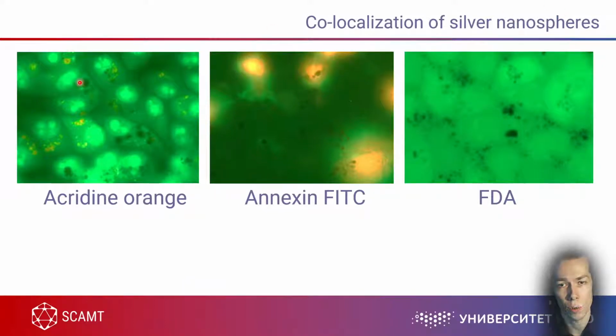Are they inside or outside? You don't even need to answer this question, because just look at the shape. The shape is very round. It means they are inside, inside some endosomes. And just look at this. It's the same nanoparticles, same culture, just different stainings. Using just FDA, you have no information about endosomes, nanoparticle uptake.